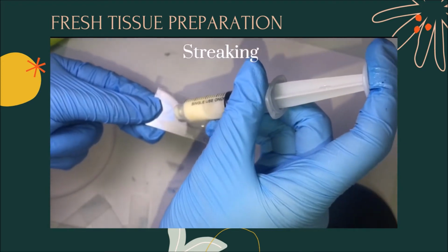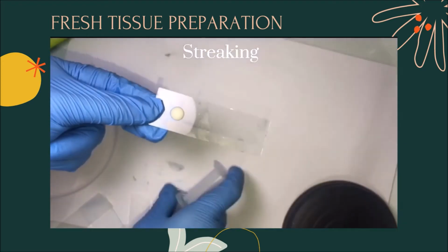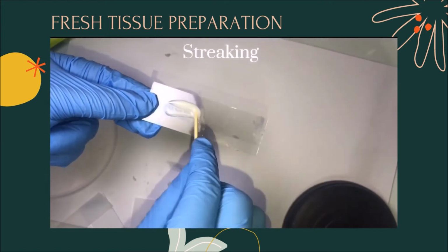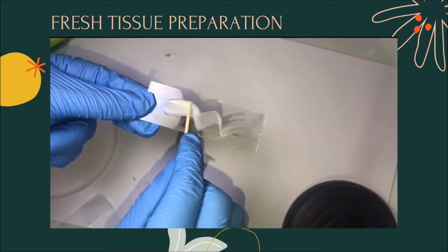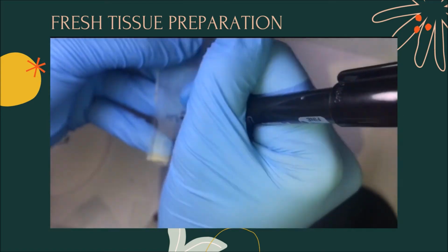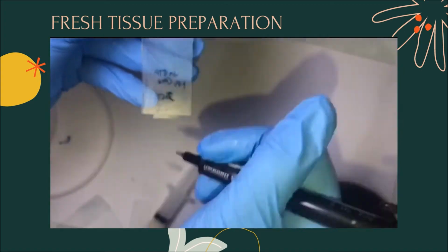For streaking, add an adequate amount of bodily fluids on the glass slide, and, using an applicator stick, streak the sediments in a straight or zigzag line. Afterwards, cover it with a cover slip. And label your slide with your name, group number, and section.